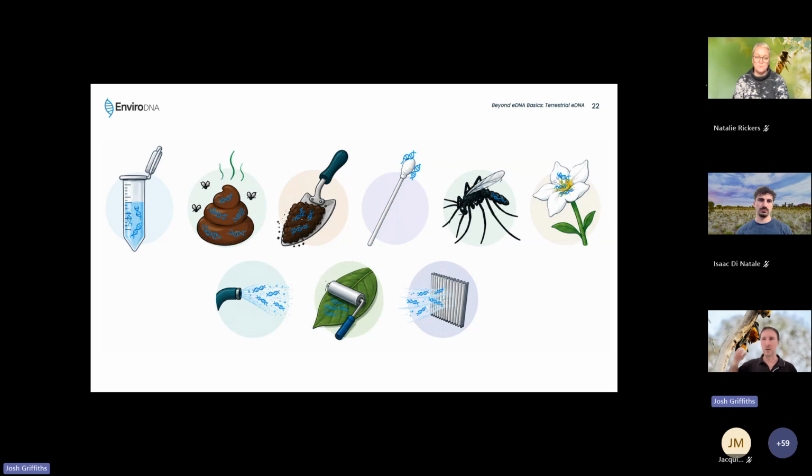Soil, I'm going to touch on soil in a little while. Soil's not so much for targeting those larger animals, but thinking about microbiome of soil, soil health, and what that means for ecosystem health. We can use simple swab processes to target surfaces, or we can swab scats as well.